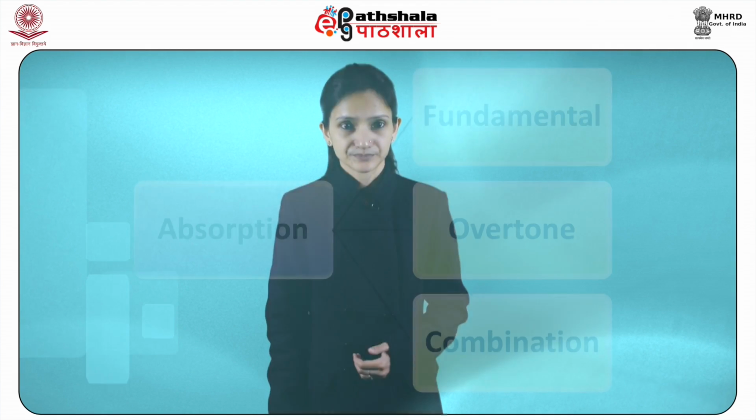In the infrared, absorption occurs only where a change of the dipole moment of a molecule can take place. This means that diatomic molecules without dipoles such as hydrogen, nitrogen and oxygen do not absorb in the infrared. Total symmetry about an absorption band will eliminate certain absorption. For example, the symmetrical ethane molecule gives no carbon-carbon stretching absorption bands.